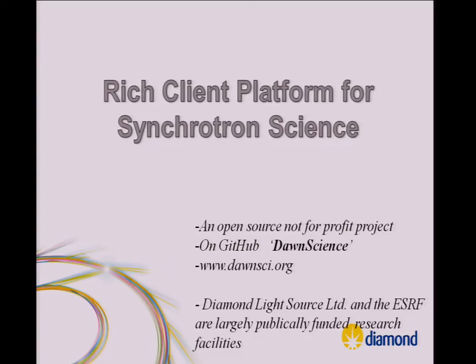The product that we're going to look at today is open source. It's on GitHub and we have a website, dawnsci.org. Very much welcome people to contribute or get involved. We would like to donate part of what we've done to Eclipse at some point, so hopefully that'll happen one day.